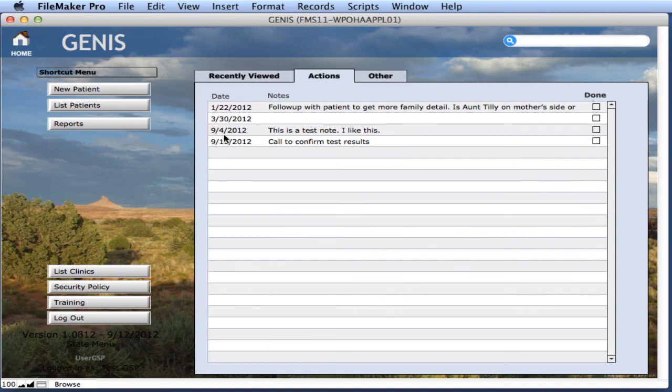And then let's get rid of this one too, just by clicking done here. And then when we commit that by either hitting enter or clicking into the gray area outside of the field, it will commit that change. By the way, notice that there's no save command here. Everything we do is always saved. It's generally when you make a click to get out from one screen to the next, that's when it commits everything you're doing on that one screen. And so your undo action is pretty much just the one thing that you're doing right then.